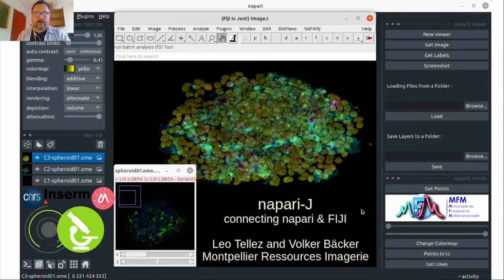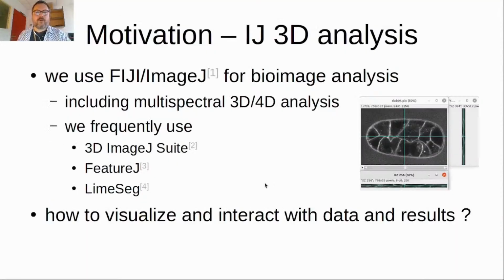My name is Volker Bäcker. I'm a bioimage analyst at Montpellier Ressources Imagerie. I'm going to talk about Napari-J, a plugin we developed at the facility.